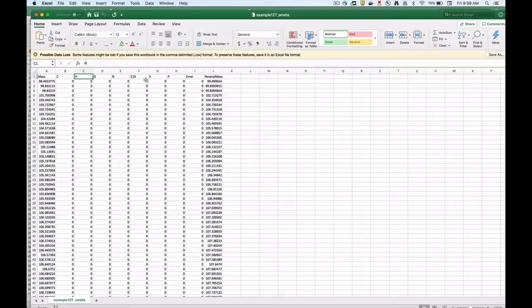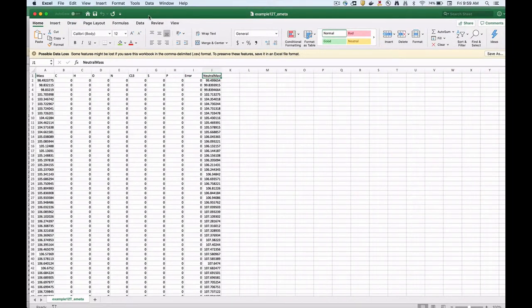There's an optional column which identifies the presence of isotopic peaks, and any other columns containing metadata corresponding to unique mass identifiers. In the video covering the Upload tab, we'll see how to get these files into FREDA and start using them in our analysis.